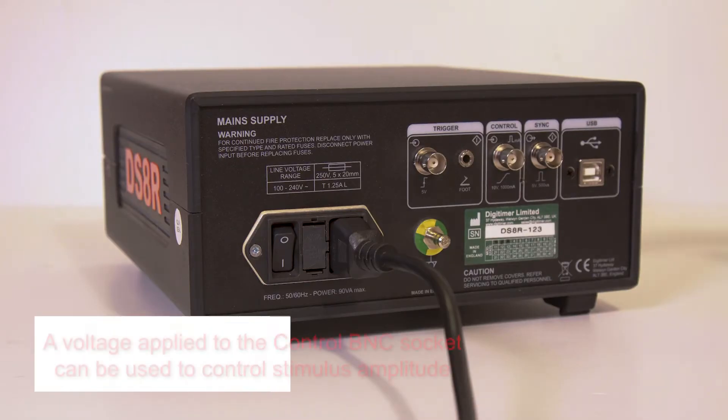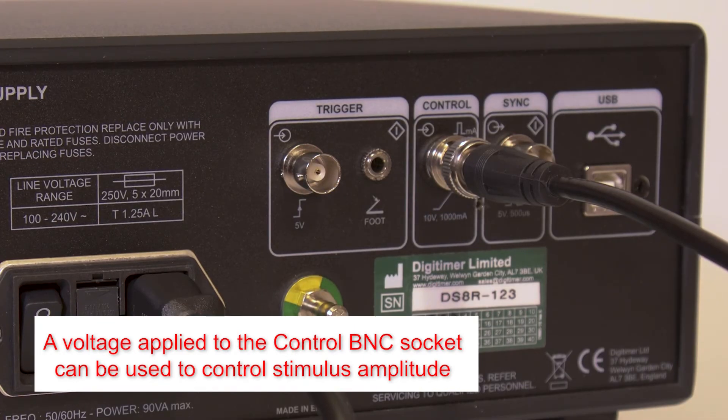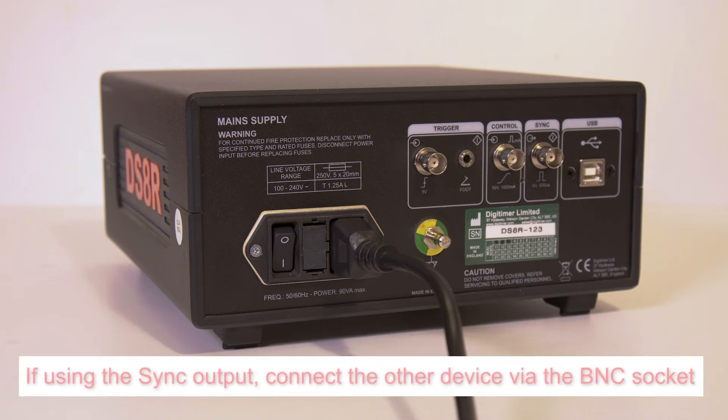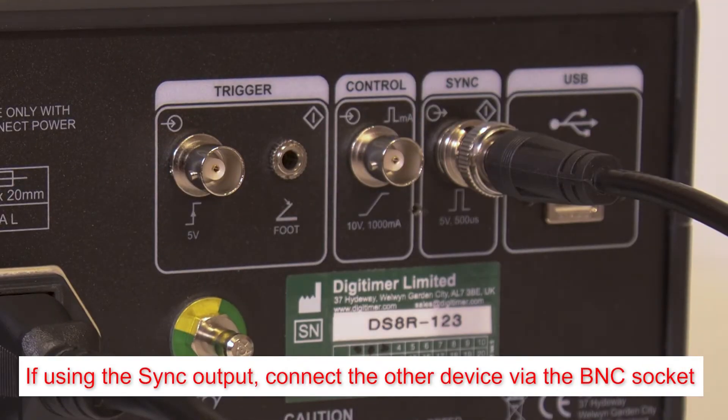If an external voltage signal is being used to set the stimulus amplitude, connect it via the control BNC socket. If a sync output or event marker is required, connect the other device to the sync out socket using a BNC cable.